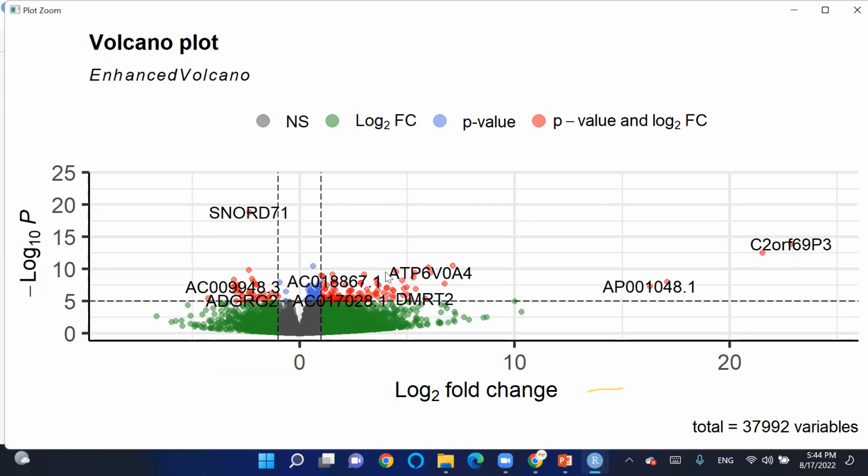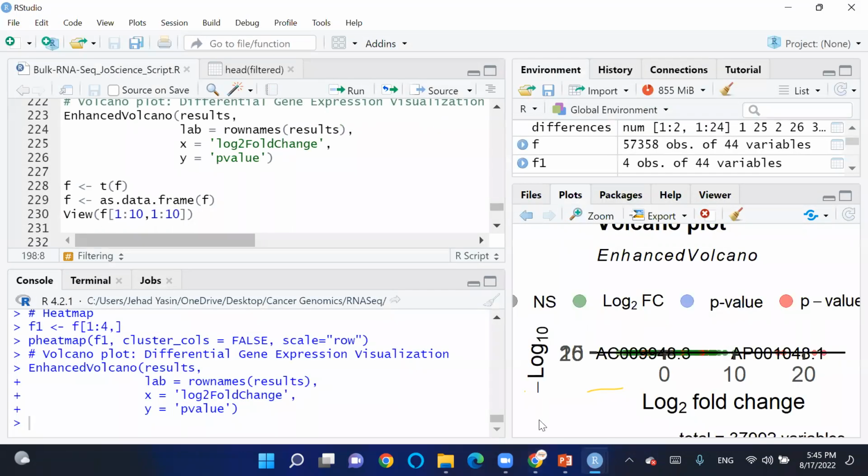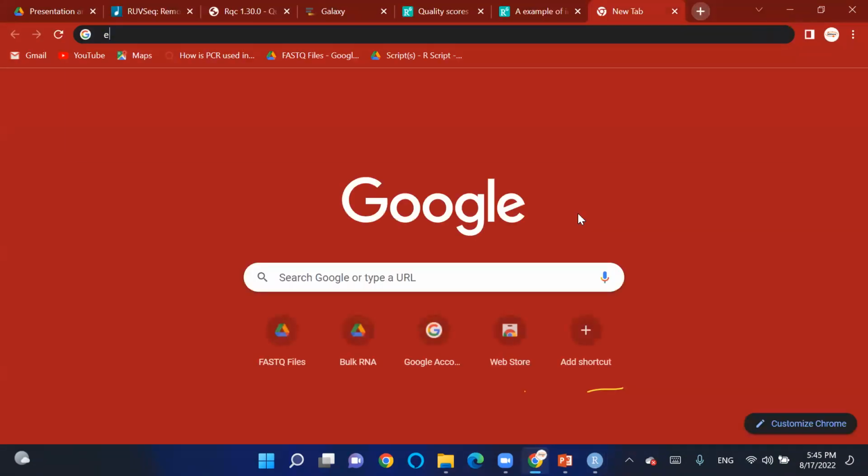This gene is highly differentially expressed. The genes in the middle are usually not significant. And usually the significance is determined by what? It is determined by the p-value and the log2 fold change together, and the dispersion, as well as the dispersion during our data analysis. Okay, as you can see here, for example, this gene is also highly differentially expressed. So yeah. If we look here.